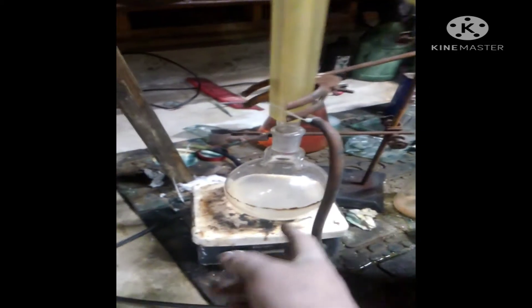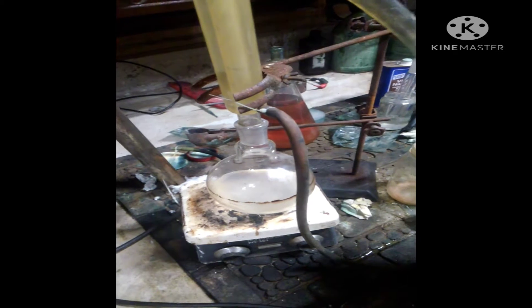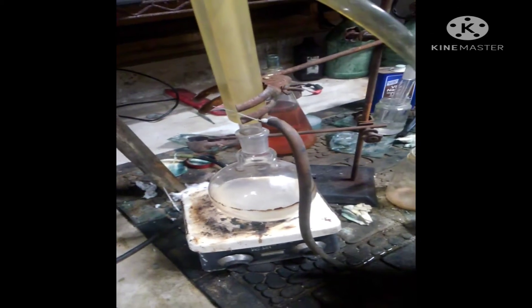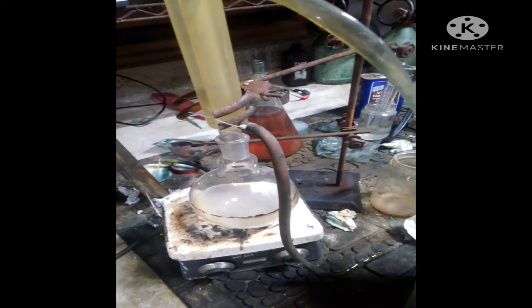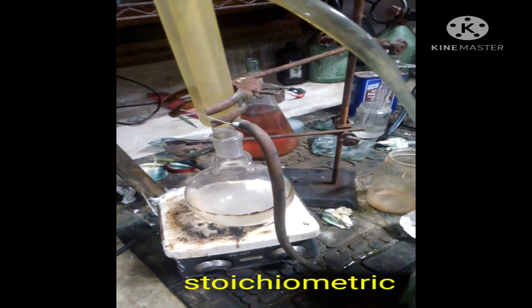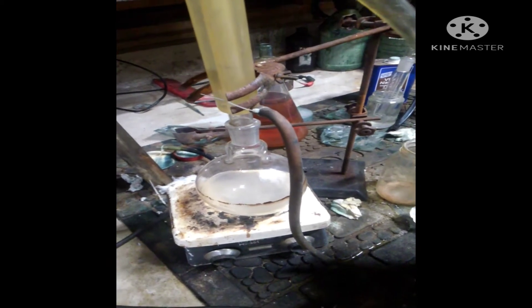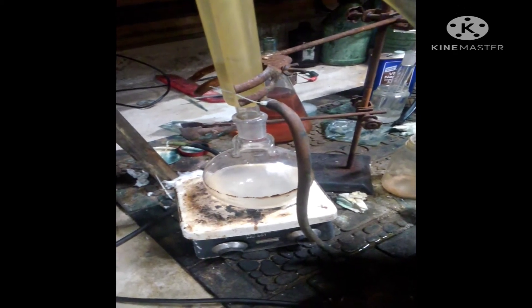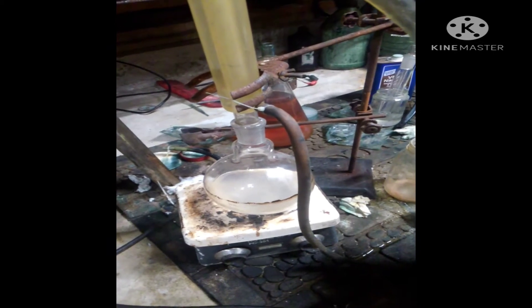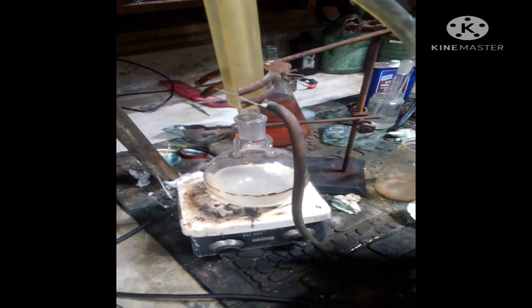You can see there's some little chunks floating in there because of residue on the ring that I can't get off, so inevitably little pieces come off. I'm going to filter it off, double check the amount I have, and then add acetic acid — a stoichiometric amount: 300 milliliters of Everclear, 300 milliliters of glacial acetic acid, and 50 milliliters of 98% sulfuric acid in a really slow addition at about a milliliter a minute.